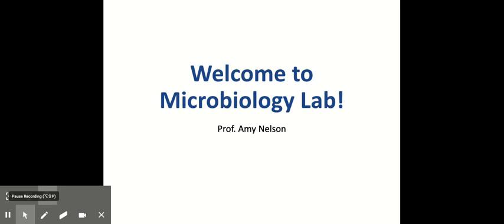Unfortunately, we can't be in person in the lab this fall, but I'm going to do my best to bring the micro lab experience to you online. Each week I will present a lesson for the topic that we're covering, and then I'll go through the protocol and show you step-by-step videos of exactly what we would be doing if we were together in the lab. Today we'll start with the first and most important lesson, which is lab safety.